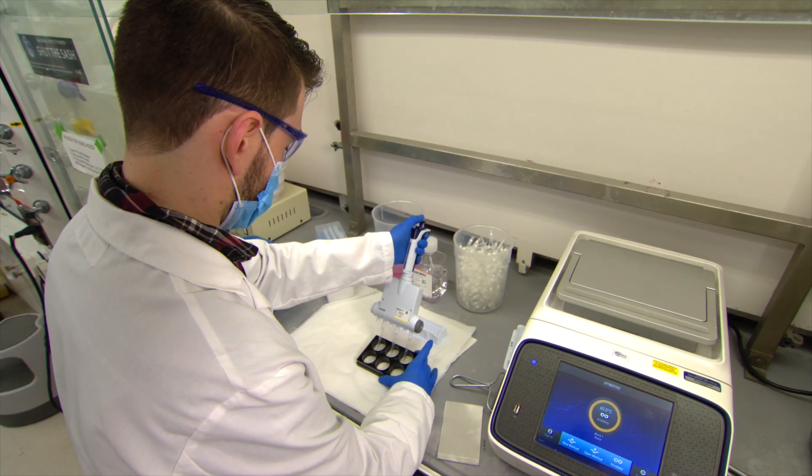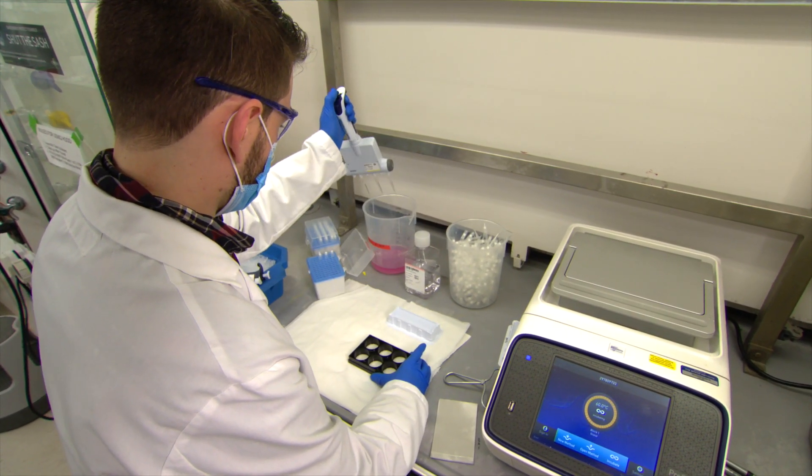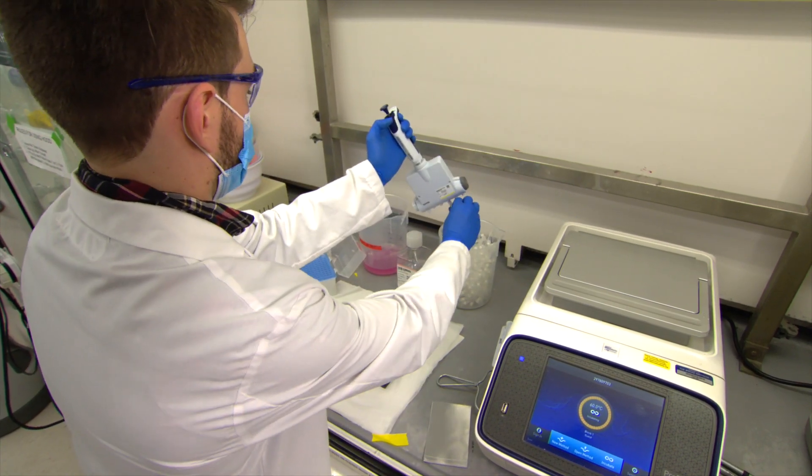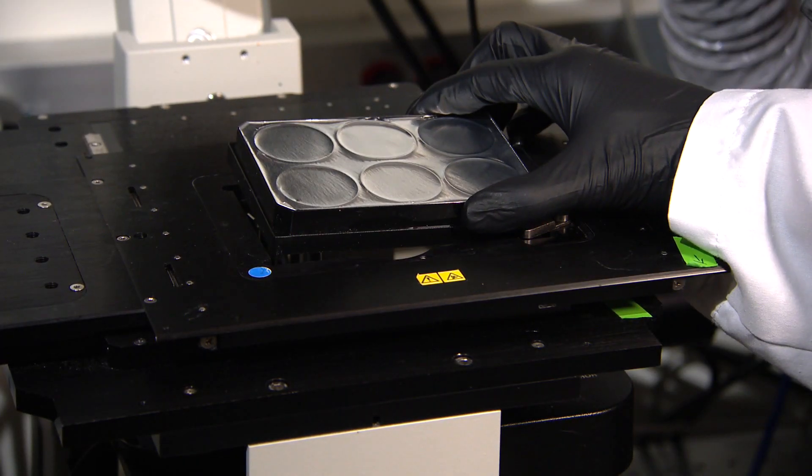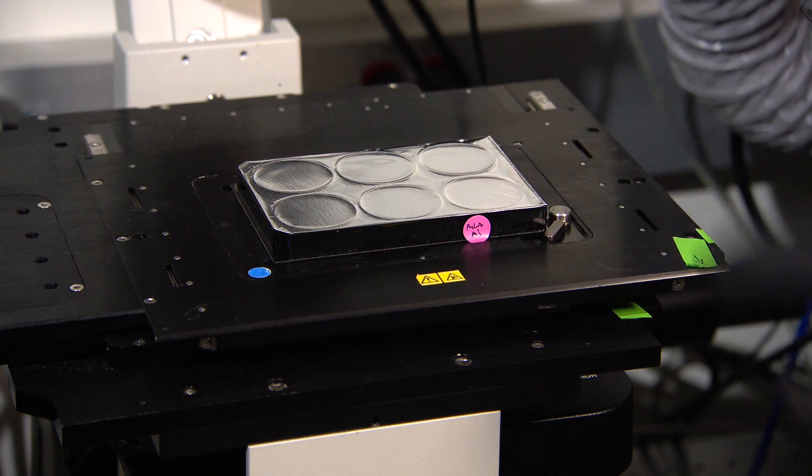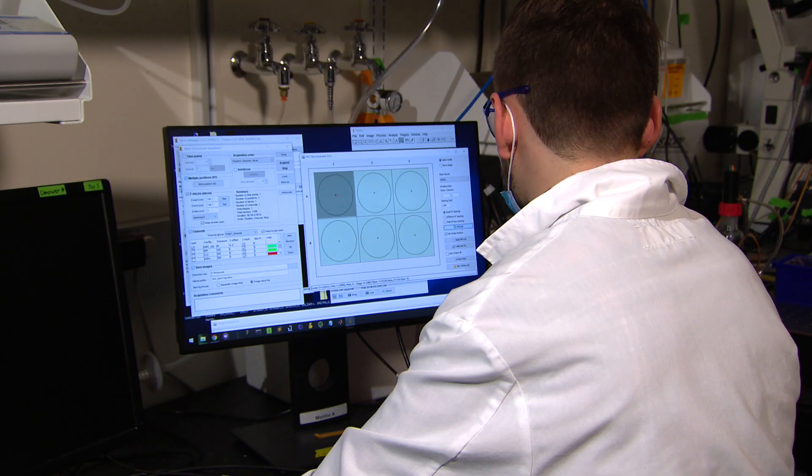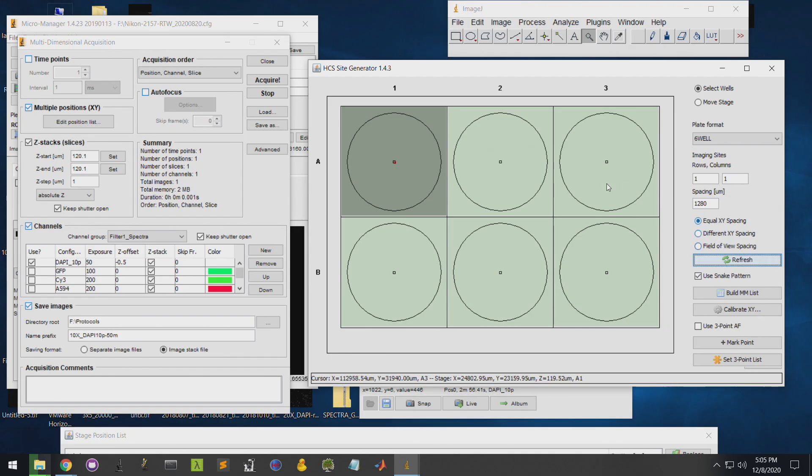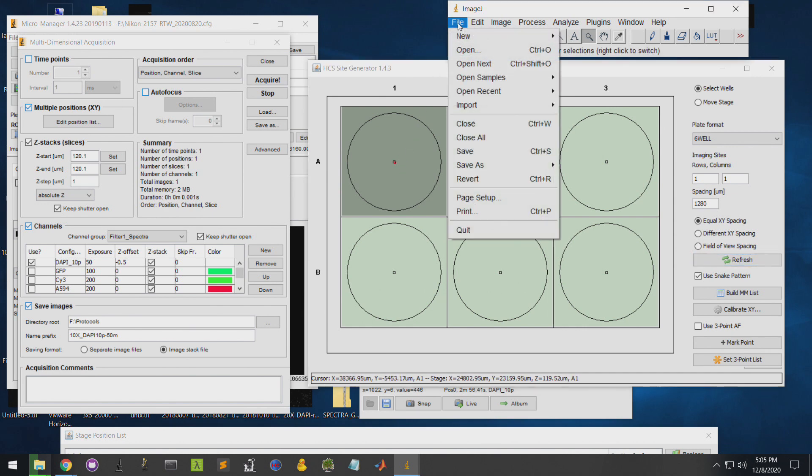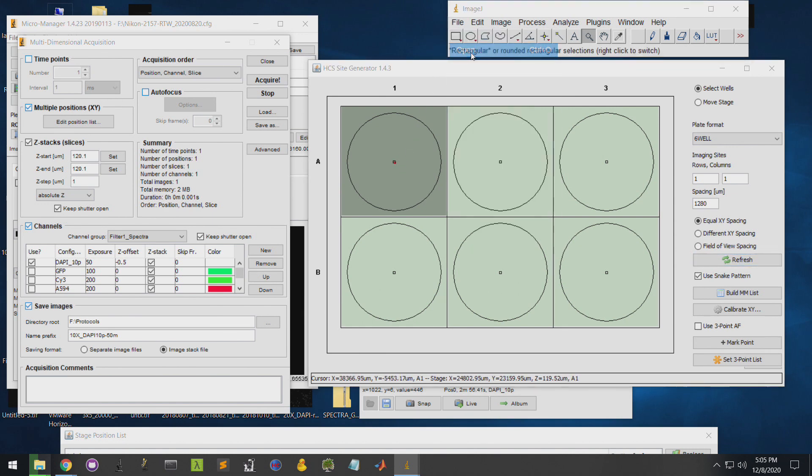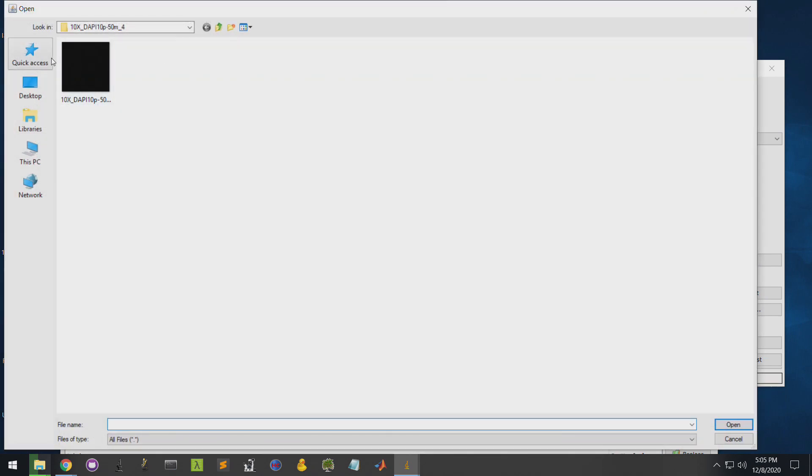Next, check for staining background in all channels and make sure the entire plate is in focus. Now, generate a grid of imaging sites for the real acquisition. In this case, we'll use a 25x25 grid with 1280 micron spacing for NF-kappa-B phenotype imaging at 10x magnification. Set a save directory and initiate the full acquisition. Following the phenotypic imaging, perform the wet lab steps for the first sequencing cycle as previously shown. Once the sample is ready, load it onto the microscope, which should be roughly aligned from the previous round of imaging.